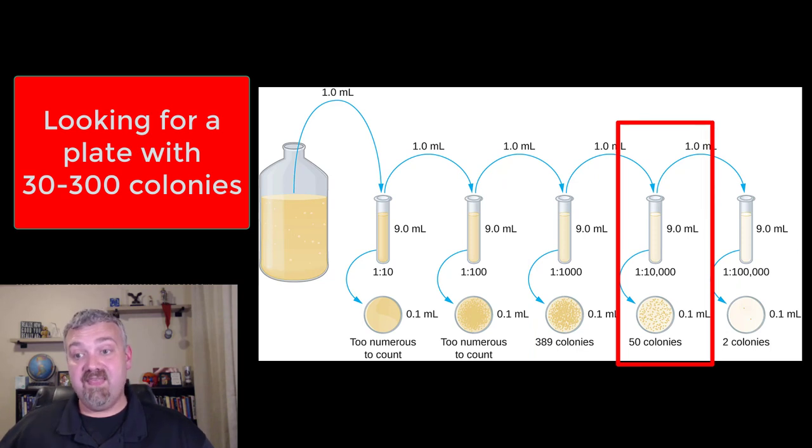So we go to the next one, which would be the 1 to 10,000 dilution sample has 50 colonies on it. And if you want, just real quickly, if you go one more time, you only see a couple colonies, so too small to work with. So out of these five plates, the one I'm most interested in is that 1 to 10,000 dilution that has 50 colonies on it.